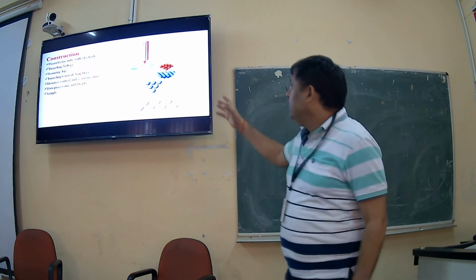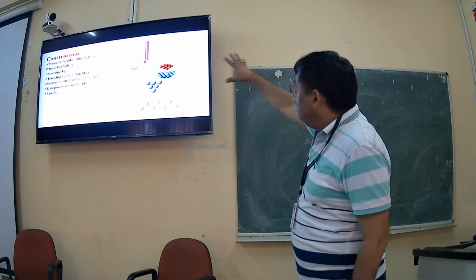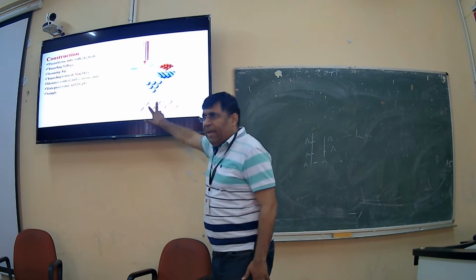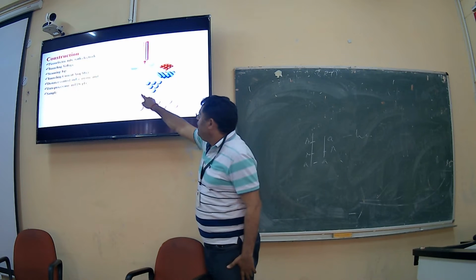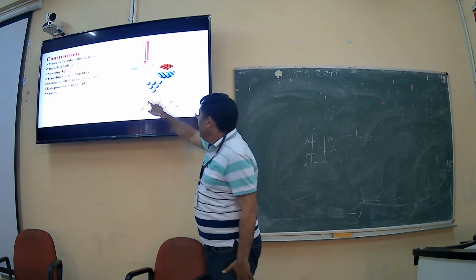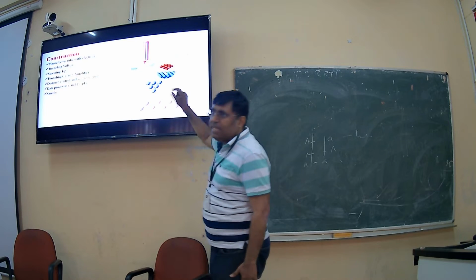Let's understand this one. So here, this is almost same. So here you can see this is your sample and this is different atomic level, because electron is showing wave function. So that's why it can go to the tips. So this is your scanning probe, and here this is your sample, and this will complete the circuit.